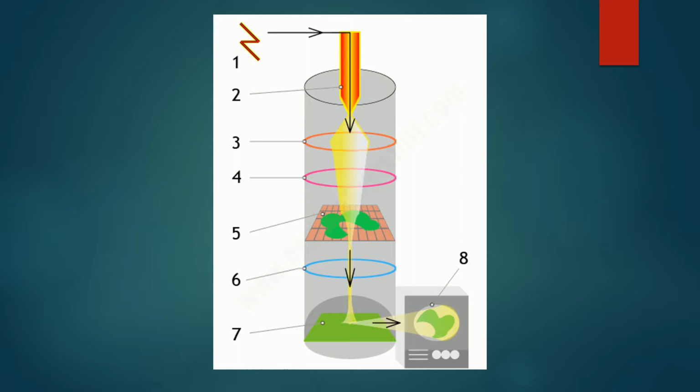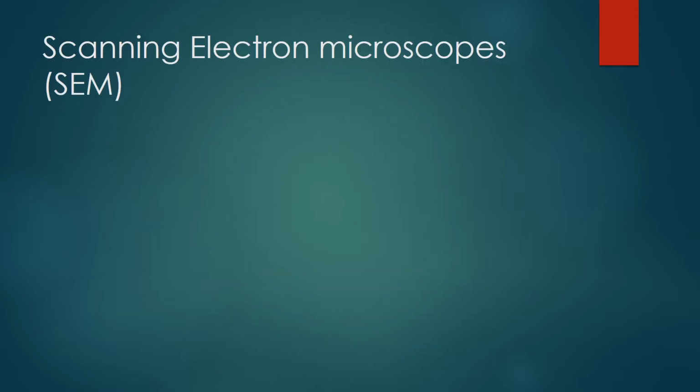The reason why the SEM and TEM have black and white images is because electrons don't correspond to wavelengths of light and colors. Colors have to be added digitally. This is based on how many electrons are absorbed. Instead of light, electrons and their wavelengths are used, which are shorter, which results in higher resolution of the image. Specimens are not directly observed. You do not look through an eyepiece. A computer forms an image based on how many electrons are absorbed by different regions of the specimen. Then the computer can make an image for us to look at.